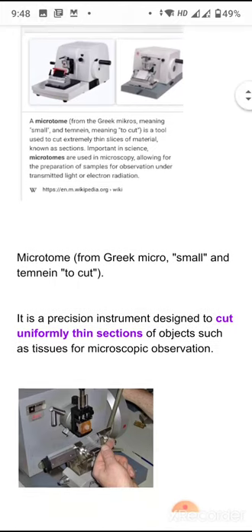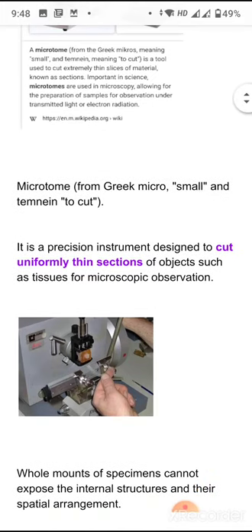The microtome is a precision instrument designed to cut uniformly thin sections of an object which we want to observe under the microscope — whether a light microscope or electron microscope.